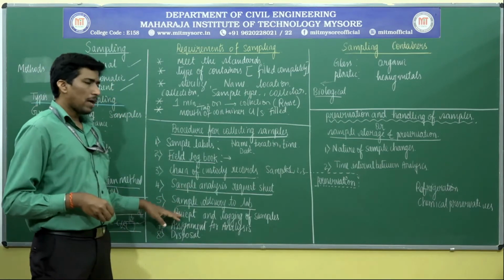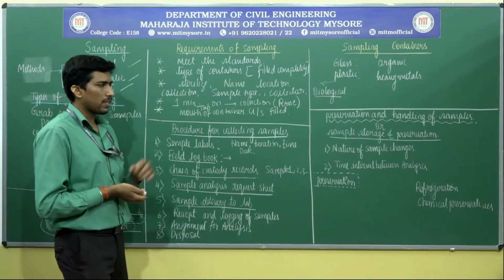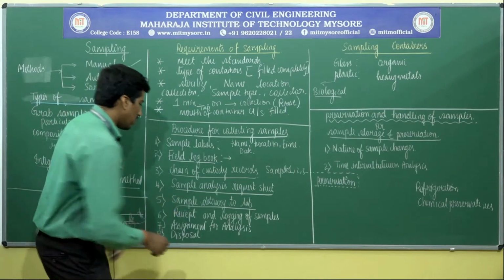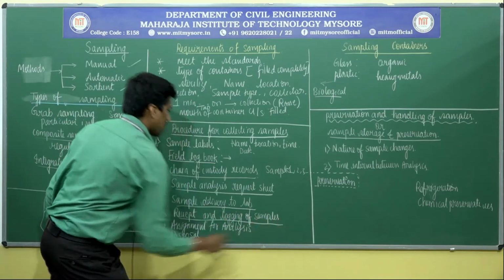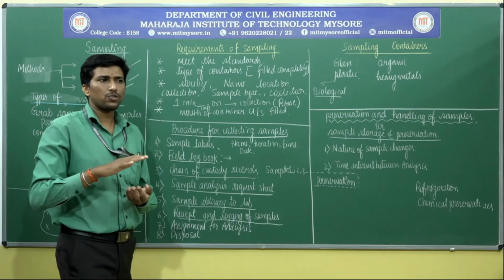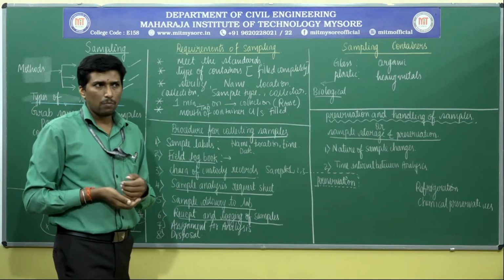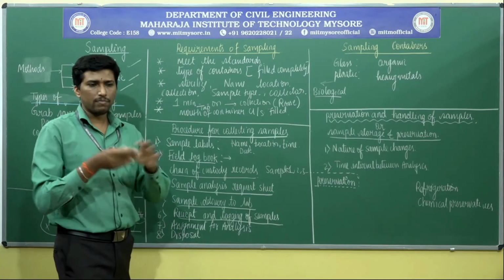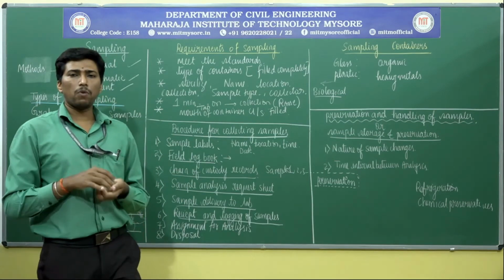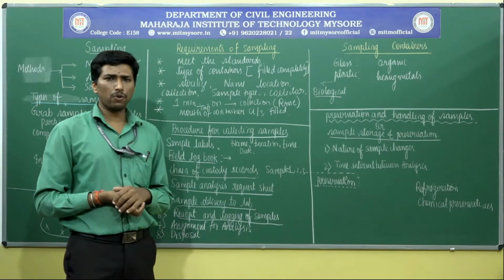Okay. So sample delivery to the lab has to be either in polyethylene bottles or in glass bottles. The next stage you come across is related to the receipt and logging of the samples. They have to be collected and completely covered, either by using polystyrene foam, which we call thermocol. Those boxes are taken and utilized, or maybe any type of boxes.